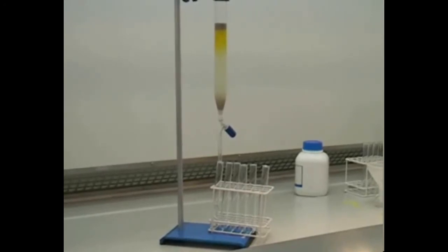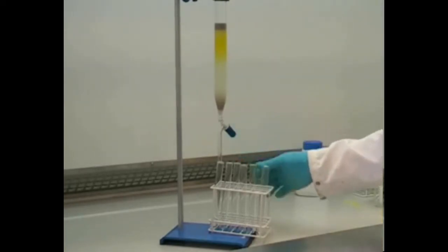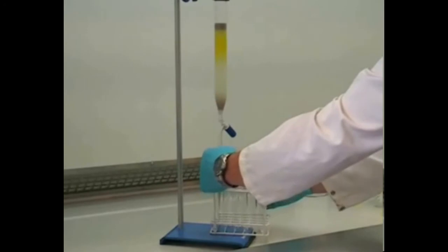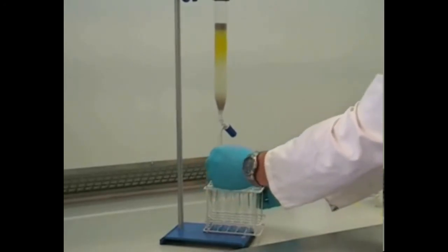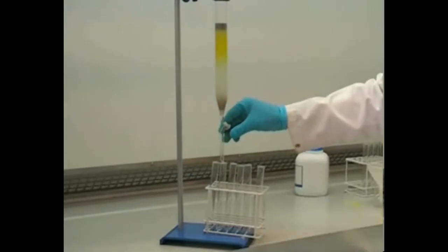In this case we're collecting the fractions in test tubes, but depending on the size of your column you may use sample vials or even conical flasks. Once collection is complete, we can close the tap momentarily to move on to collect fraction number 2. This process can be repeated any number of times to collect as many fractions as are required.